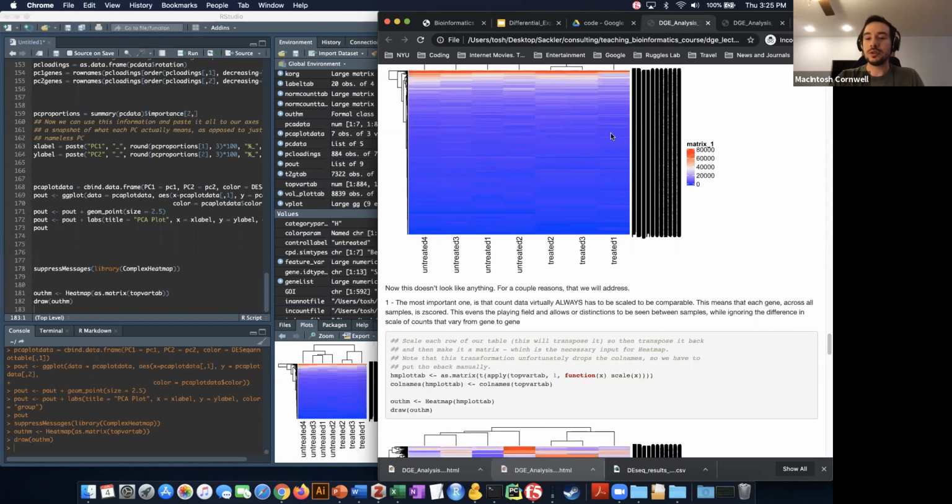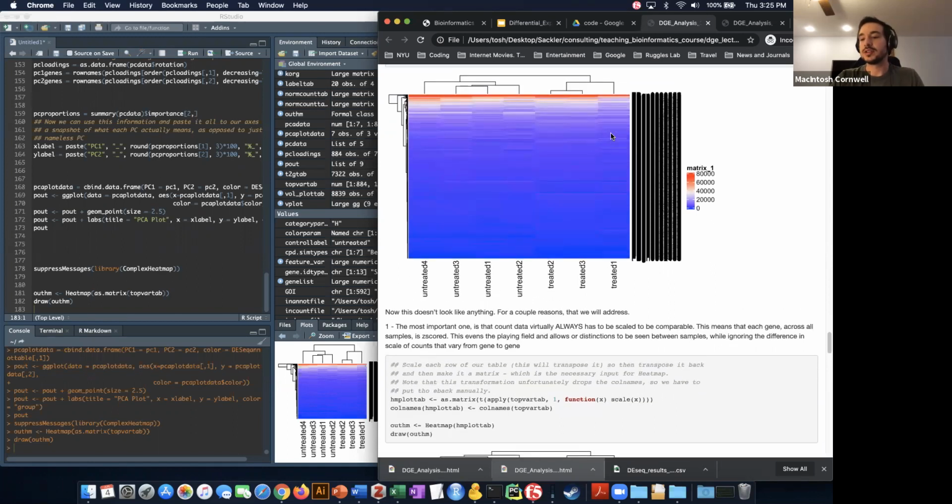What this will do is, it's essentially just a z-score operation, for those who are maybe a little unfamiliar with that. Basically, it'll look at the 7 samples across each feature. It'll set the average to 0. So if the average is actually 1,000, it'll subtract 1,000 from everything and scale everything down. And then it'll just assign each value its standard deviations away from a mean of 0.